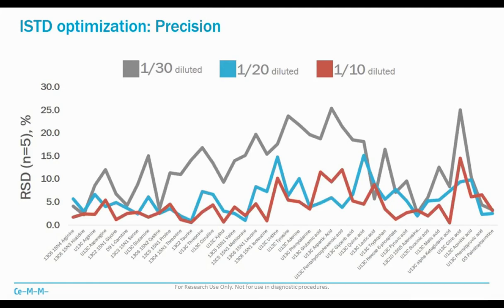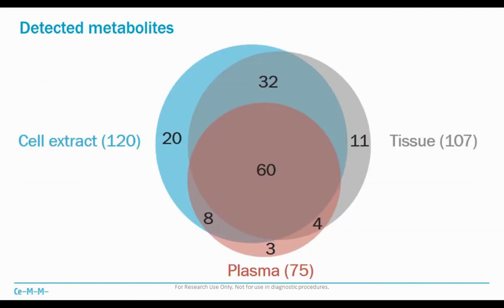even though we know that we sacrifice chromatographic performance for a handful of compounds. But this is a compromise we were willing to take.